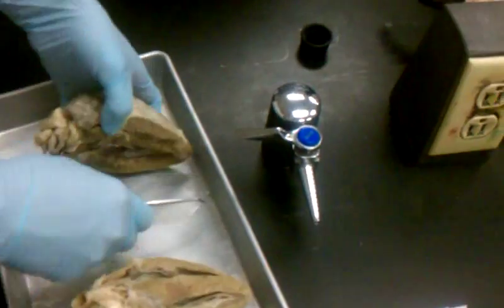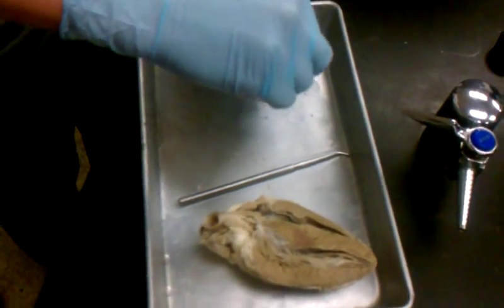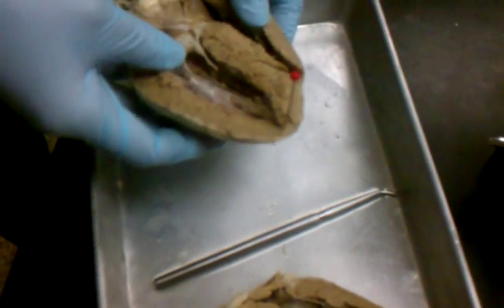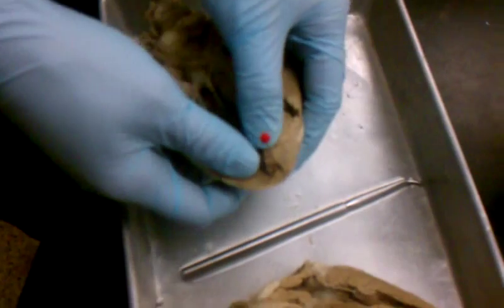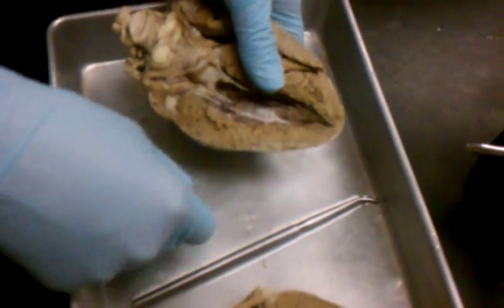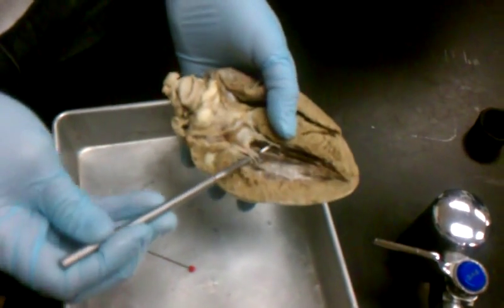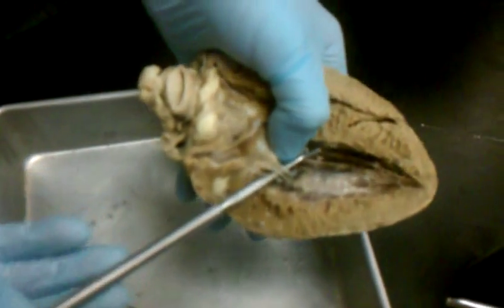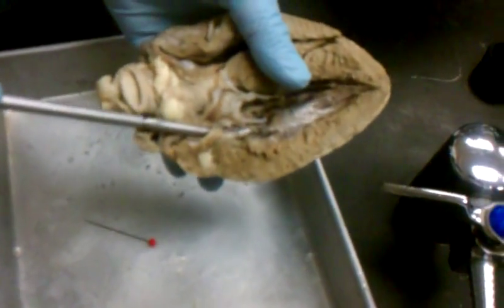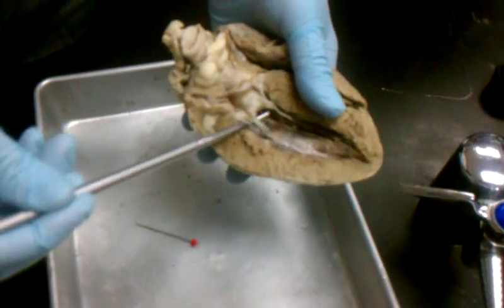So myocardium. If I were to pin this muscle, and ask you, what muscle is this? Myocardium. Myocardium is the muscle at the bottom, the apex of the heart. Then you have the chordae tendineae. If I put my probe through here and I ask you what structure is this, what would you tell me? Chordae tendineae. If I ask you what valve, what would you tell me? Bicuspid.